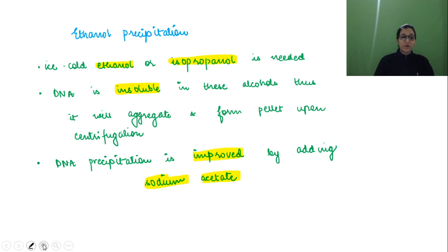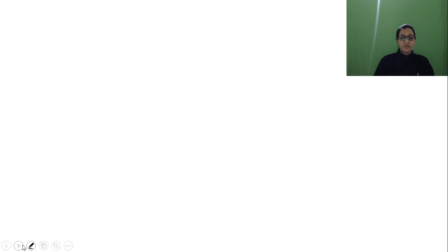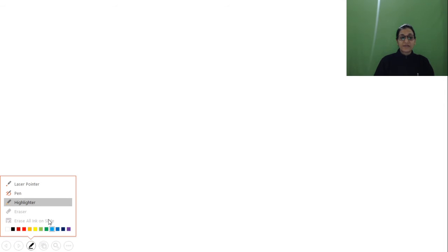So this was ethanol precipitation. After this, we need to see phenol chloroform extraction.